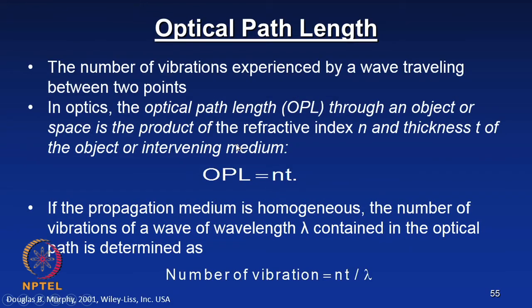We will now look at another important parameter called optical path length.